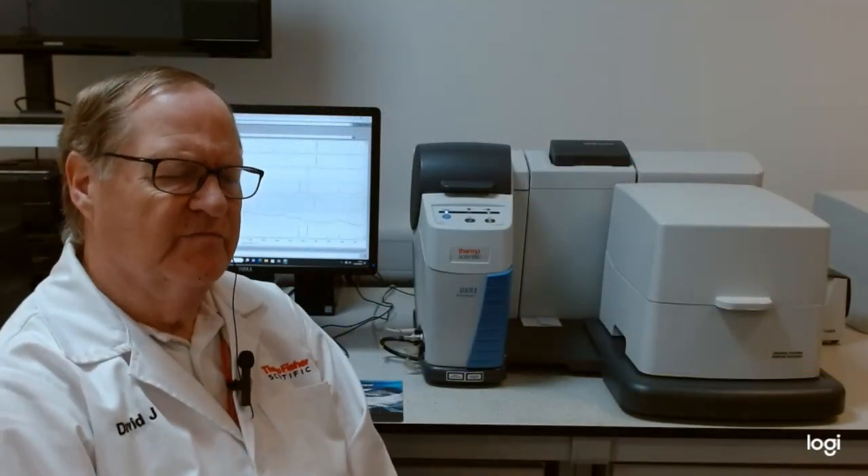The DXR3 Smart Raman is a bulk analysis system which gives great flexibility and also versatility in the sampling capability for looking at bulk samples.